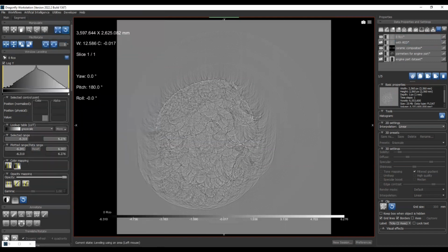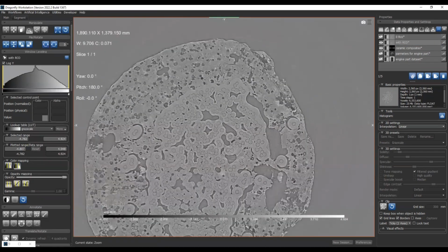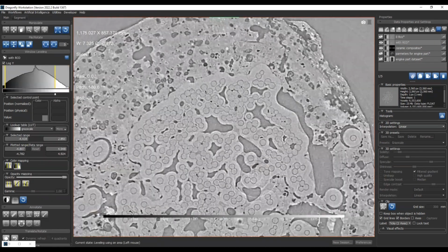Okay, here we can see the difference very clearly. With 0 offset, we couldn't even see any feature. But with the rotation center offset, it shows a very good result. Okay, so that's 3 Tomopy algorithms.